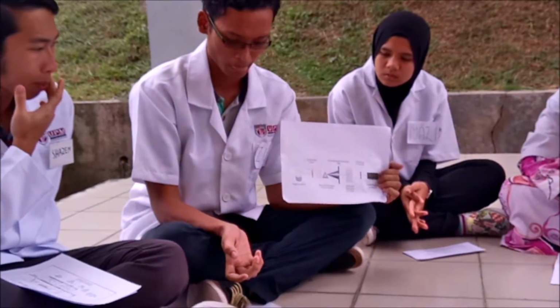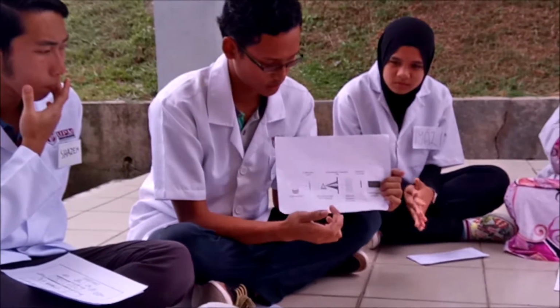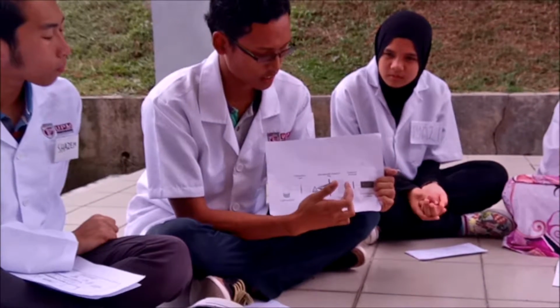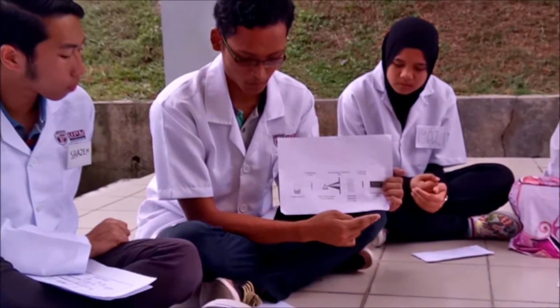So the last part will be the detector. It will detect the light. This detector is made up of a photocell. There are two types of photocell commonly used: the photomultiplier and the silicon photodiode. So I think that's all for my part.